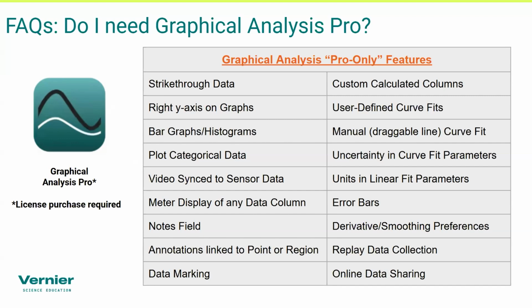But the things you know from Logger Pro mostly are here, like strike through data, a right y-axis graph, error bars, custom equations and calculated columns, a user-defined curve fit, and a specific notes field where you can add notes. All those things are in the Graphical Analysis Pro requirements.